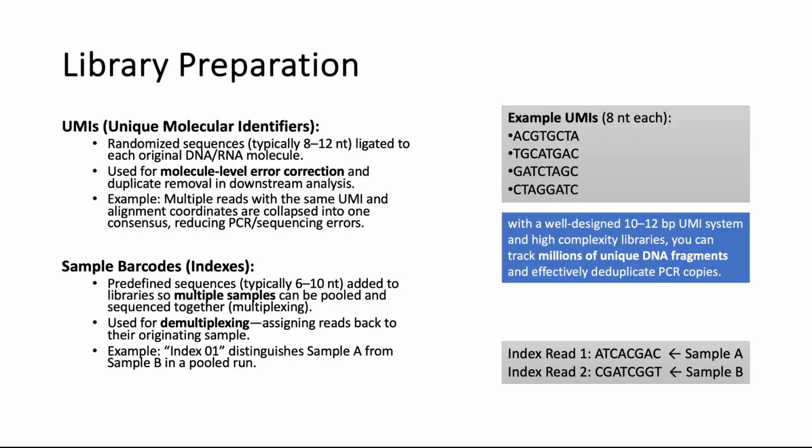And it could be used later on the error correction stage, where we will be able to select the best reads from the whole amount of multiple reads that we have. And these libraries of UMI contain millions of unique DNA fragments, and they can efficiently be used to identify each molecule in our sample set.